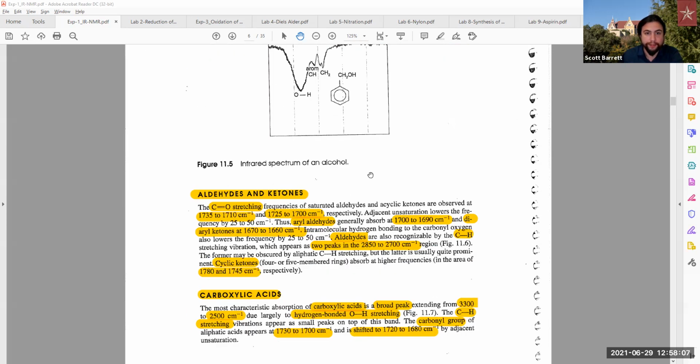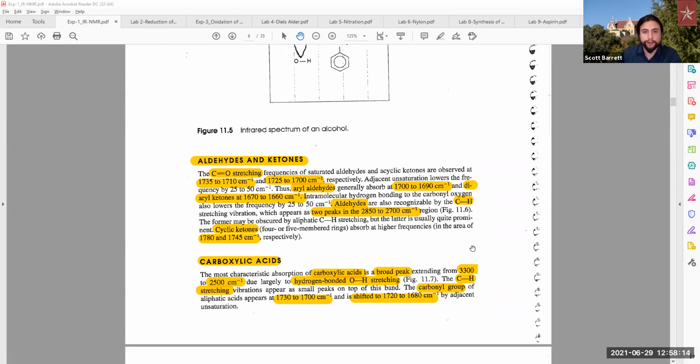And now speaking of the carbonyls, this is the really important thing because it is kind of hard to understand when you're looking at a sheet and you see an IR spectrum of what kind of carbonyl you're going to be looking at. So it's important to try and remember the relative range.